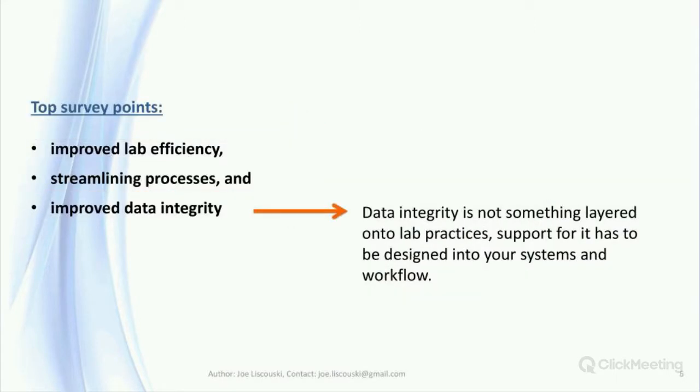Data integrity has always been important, but the emphasis on that subject is growing as problems are being recognized. You can't tweak things into improving data integrity. You have to design workflows and systems, either manual or automated, to reflect that need.